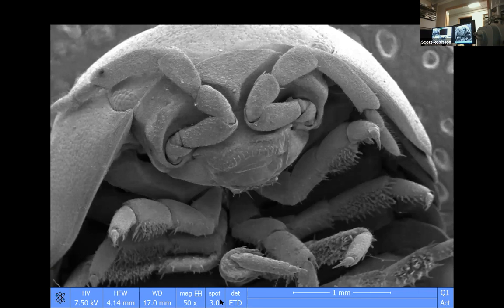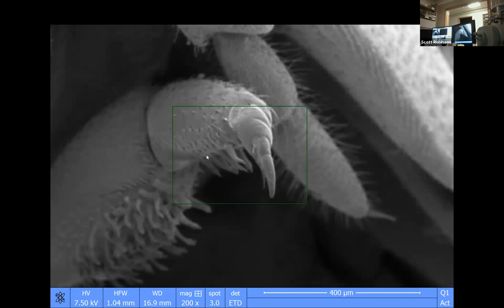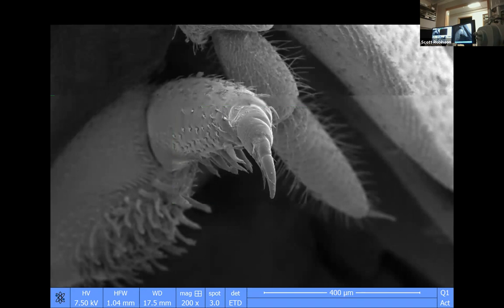Roly-polies are called isopods, and this one looks like it has 7 pairs of legs, and they're called isopods because iso means the same and pod means foot. And the idea is that each of the little feet is about the same. So this is what we're looking at, one of the feet of a roly-poly.